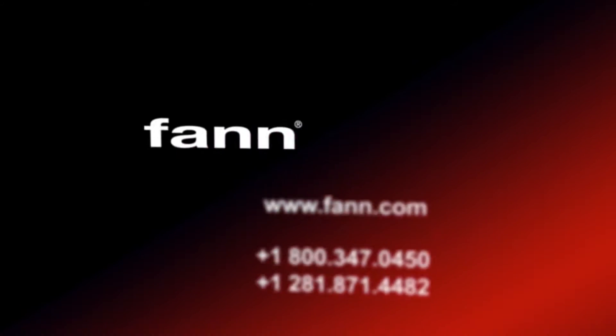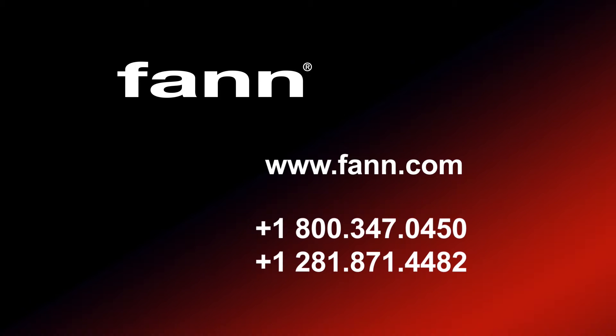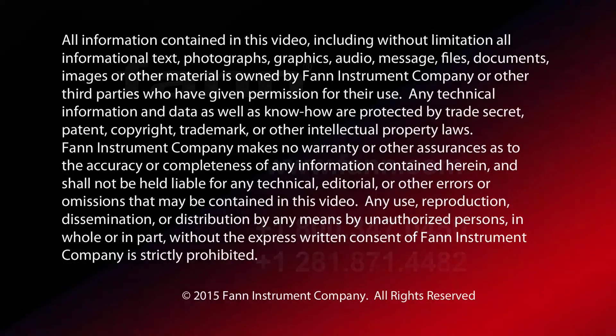For more information about the model 802P roller oven and high-temperature aging cell, contact Fann Instrument Company online or by phone.